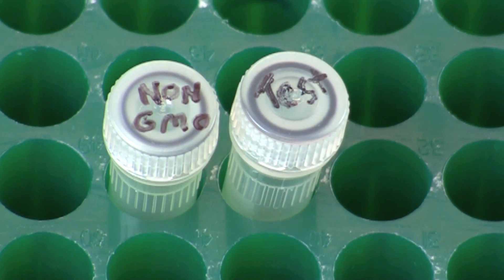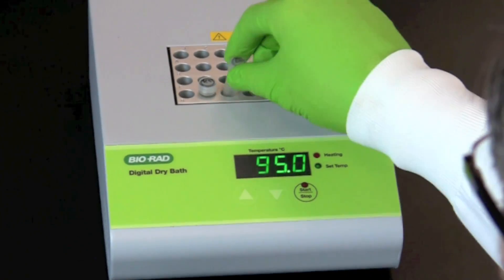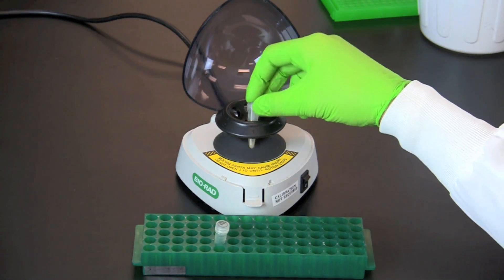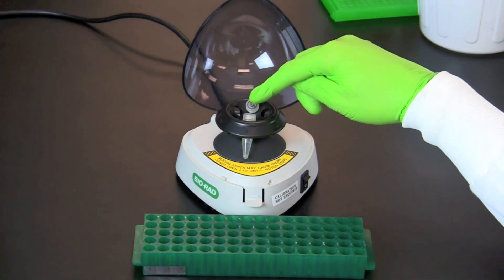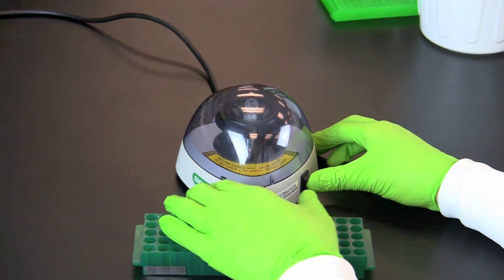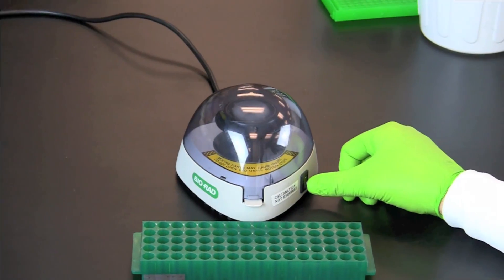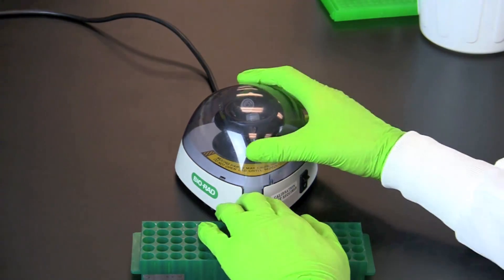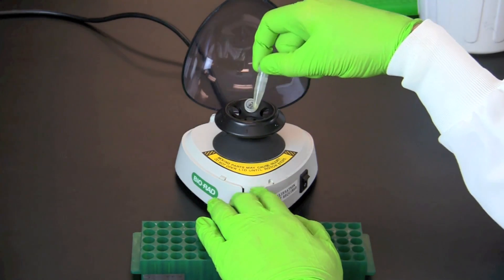Incubate the non-GM and test screw cap tubes at 95 degrees Celsius for 5 minutes. Place the tubes in a centrifuge in a balanced configuration and centrifuge for 5 minutes at maximum speed. If you are using a mini centrifuge that can only reach 2000 g's, centrifuge for 10 minutes. The samples can be stored at 4 degrees Celsius for up to a month, but do not freeze the samples.